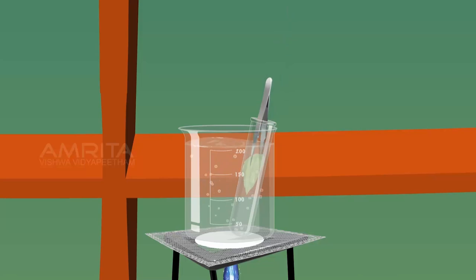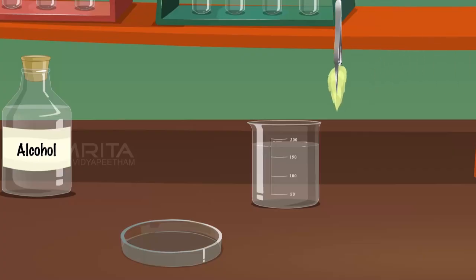Take the leaf from the boiling tube using forceps. Dip the leaf in a beaker containing distilled water and wash it. Place the leaf in a petri dish.